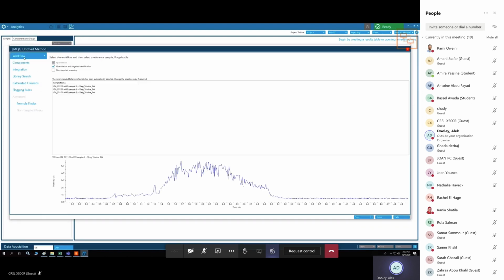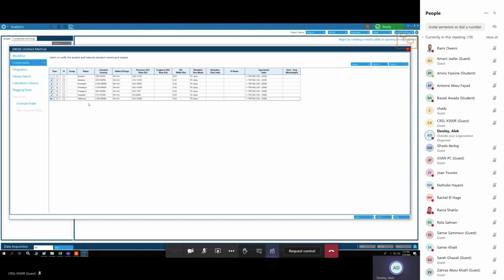Okay, so let me see. Sometimes the software is a little weird. It won't give me an extra row below now. But I was just going to demonstrate. What is going on?